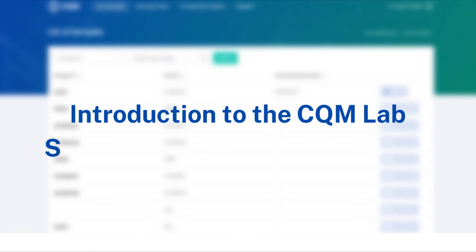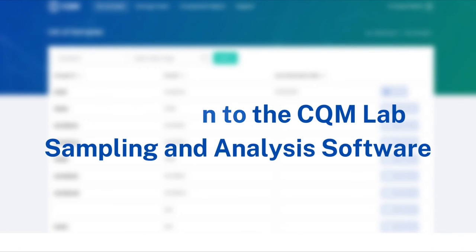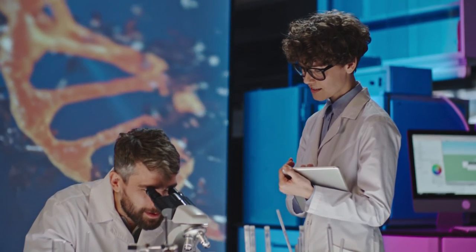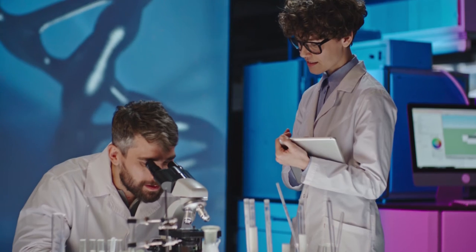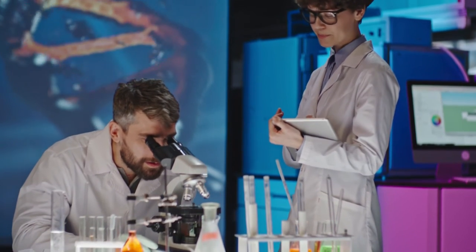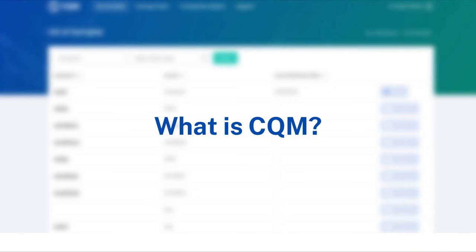Introduction to the CQM Lab Sampling and Analysis Software. In this video, we walk you through a comprehensive overview of the lab console of the CQM Lab Sampling and Analysis Software. What is CQM?